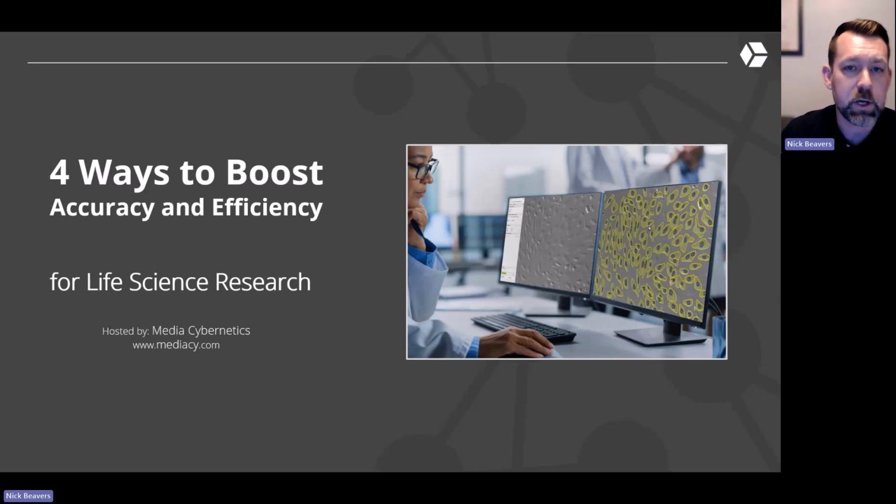So we'll just check really quick for anything that has come into the chat and see if there's anything that we can answer. So a couple things. I'm trying to reply to these in the chat, but this comes from Jacob: is it possible to measure linear objects, such as distance between 2 points on the image, something that could help define position of 2 objects? Absolutely.